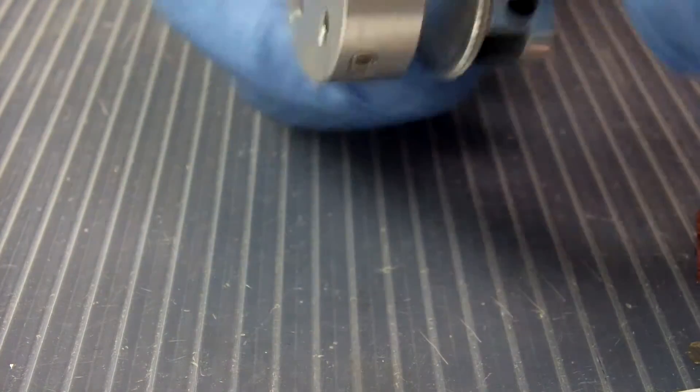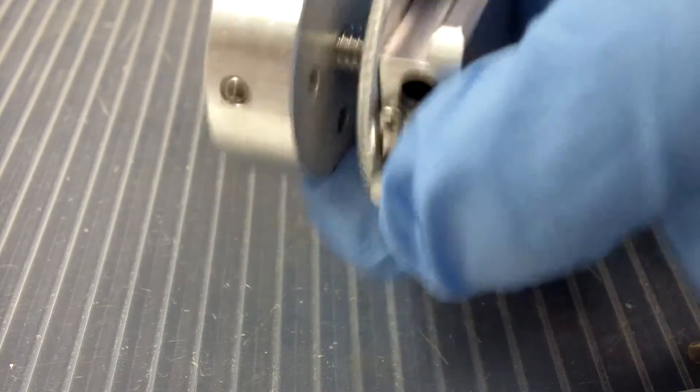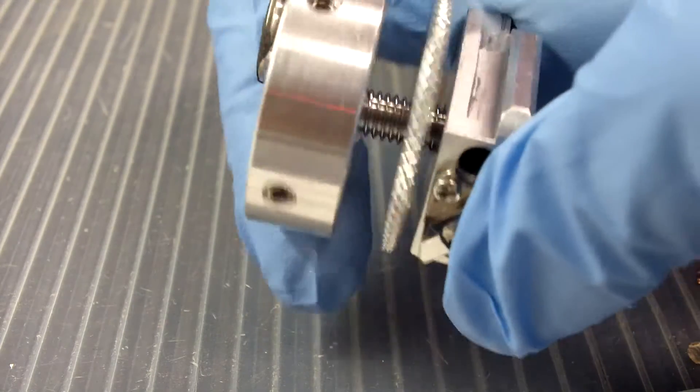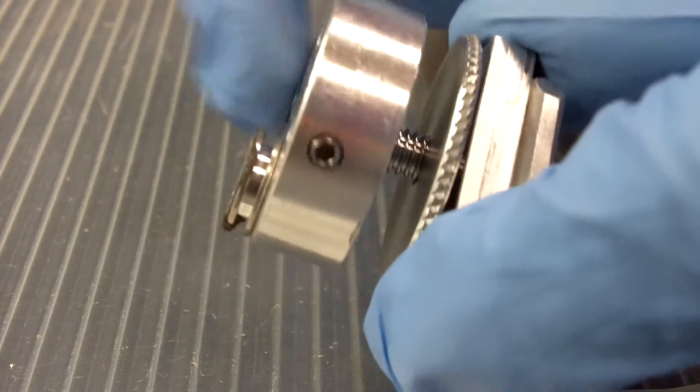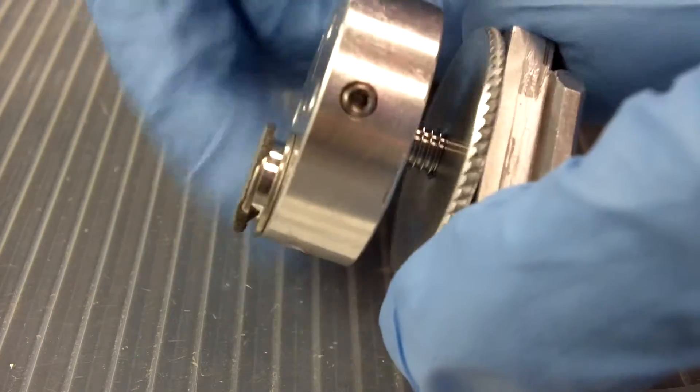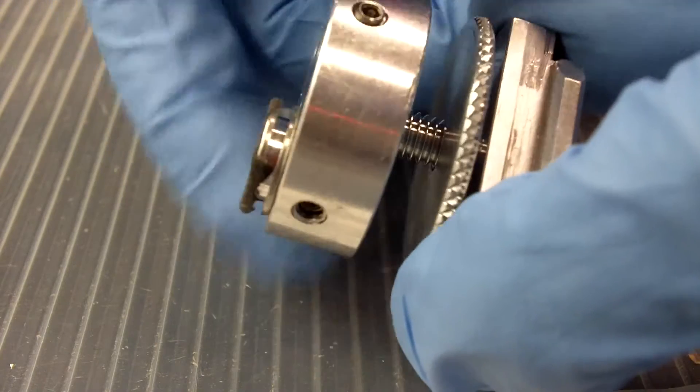Now if I need to adjust the height of the sample up or down, all I need to do is loosen the locking ring like this and screw the screw in and out of the base to make it go higher or lower or lower and higher.